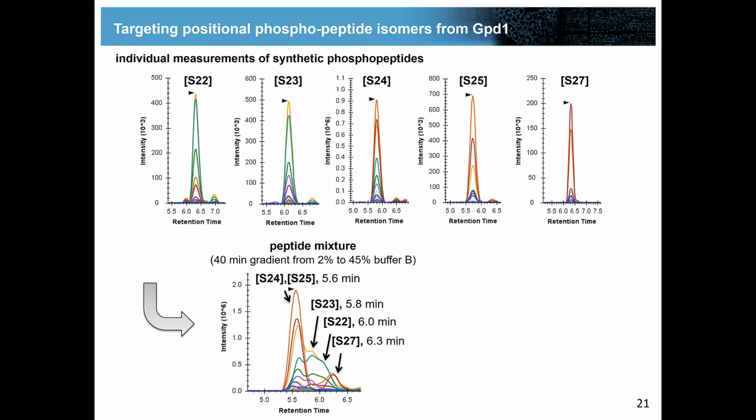However, what I learned there was that I got something like 4 shouldered peaks, but most of the peptides were not perfectly coeluting. They were still somewhat separable, even though far away from baseline separable.